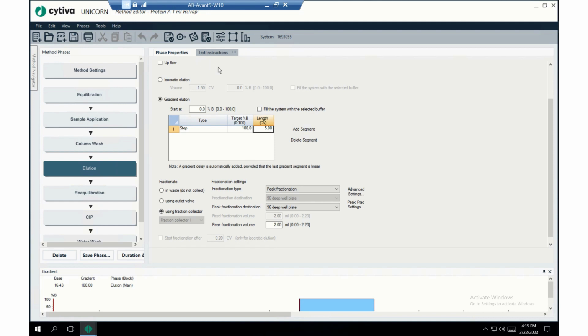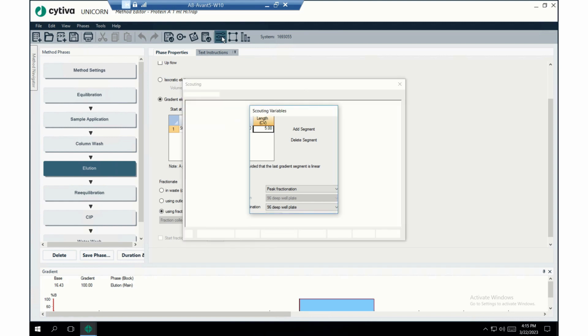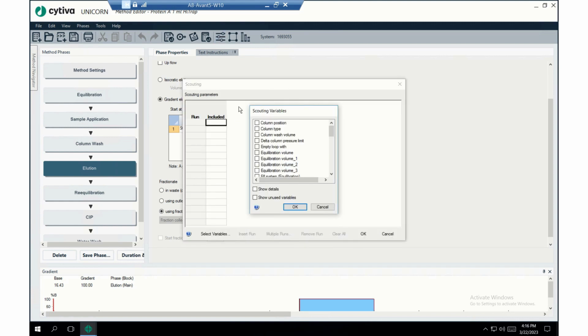Scouting is really easy to turn on. You just have to hit this button right here that says Scouting. And so I guess these little bars are like, oh, I want to change this variable a little bit to the right. I want to change this variable a little bit to the left. And so this is sort of a window within a window. And what comes up is the Scouting variables. And what we need to do is, from the variable list that we see, like when we start a method, we need to pick which ones we want to be able to possibly change with Scouting.